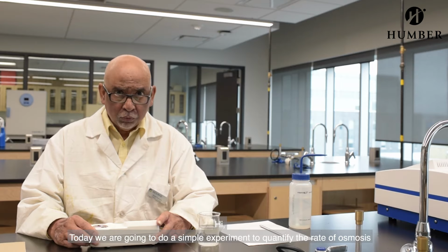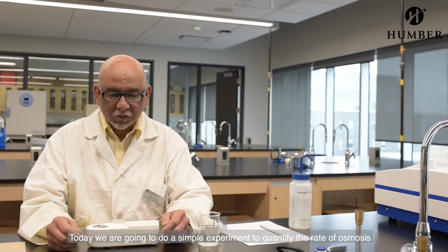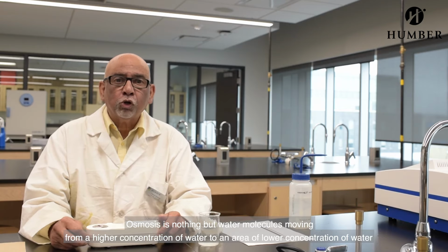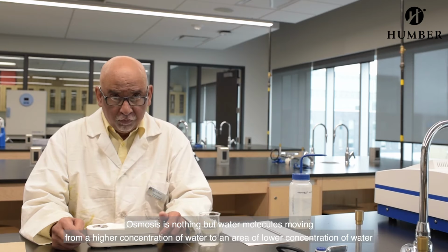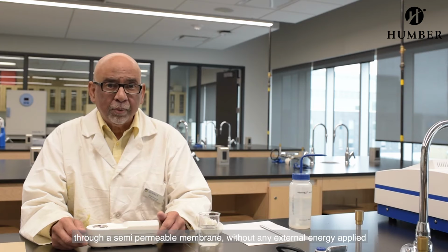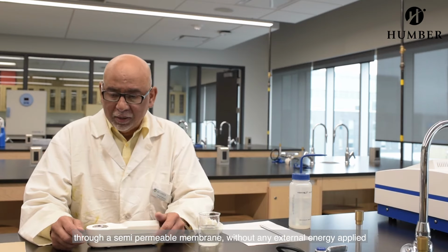Hi, today we're going to do a simple experiment of quantifying the rate of osmosis. Osmosis is nothing but water molecules moving from an area of higher concentration of water into an area of lower concentration of water. Of course, it's going through a semi-permeable membrane, and once again, there is not going to be any external energy applied.